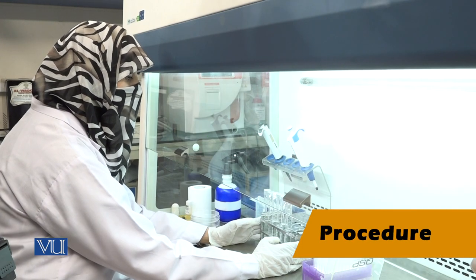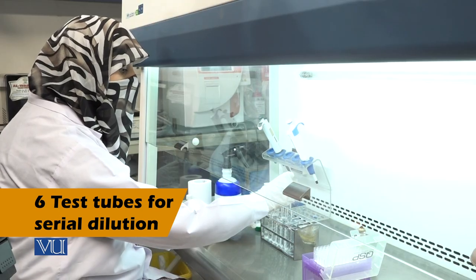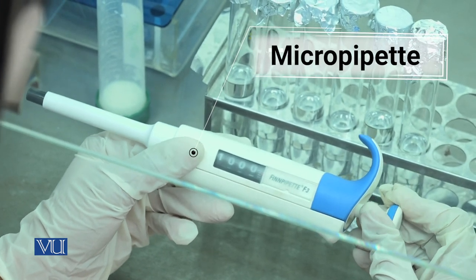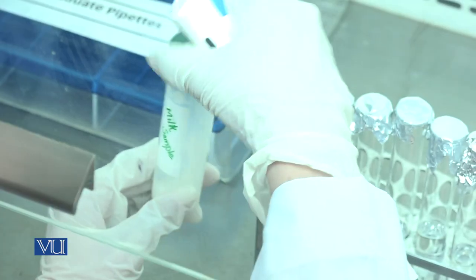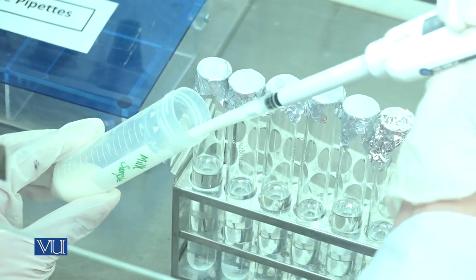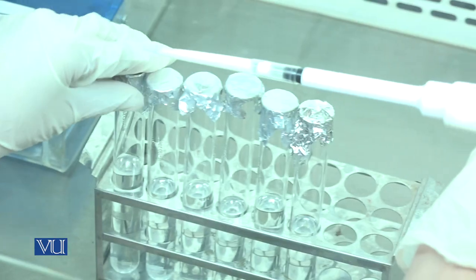For the preparation of serial dilutions, the standard procedure is used. First, take 6 test tubes each having 9 ml of sterile distilled water. Set the micropipette at 1000 microliters for taking the sample. Pick 1 ml of sample and add it into the first test tube.